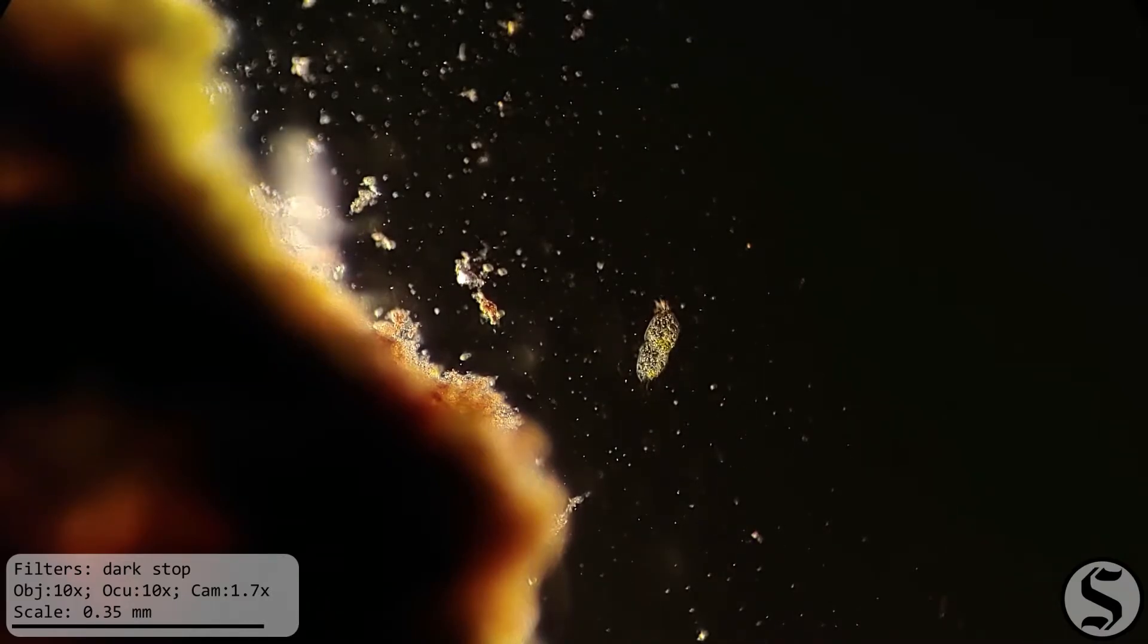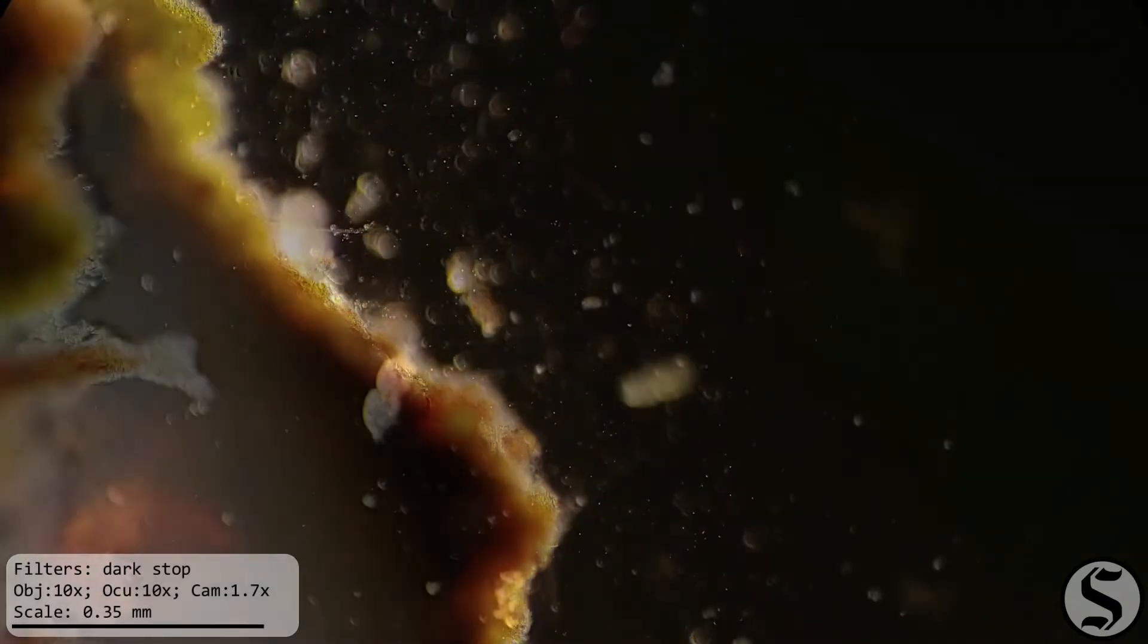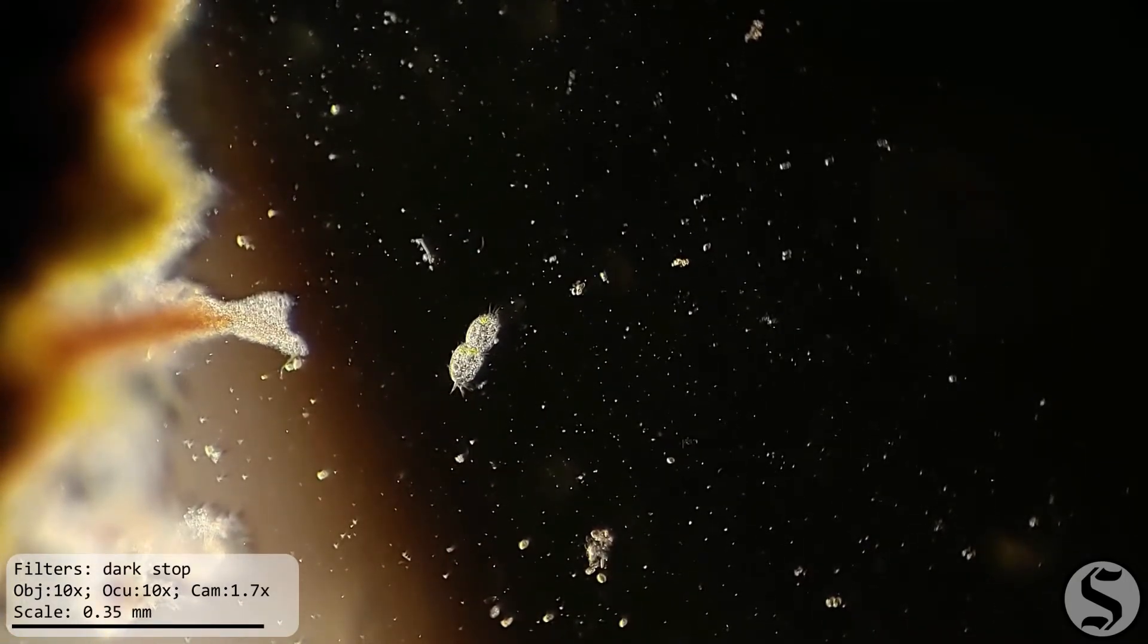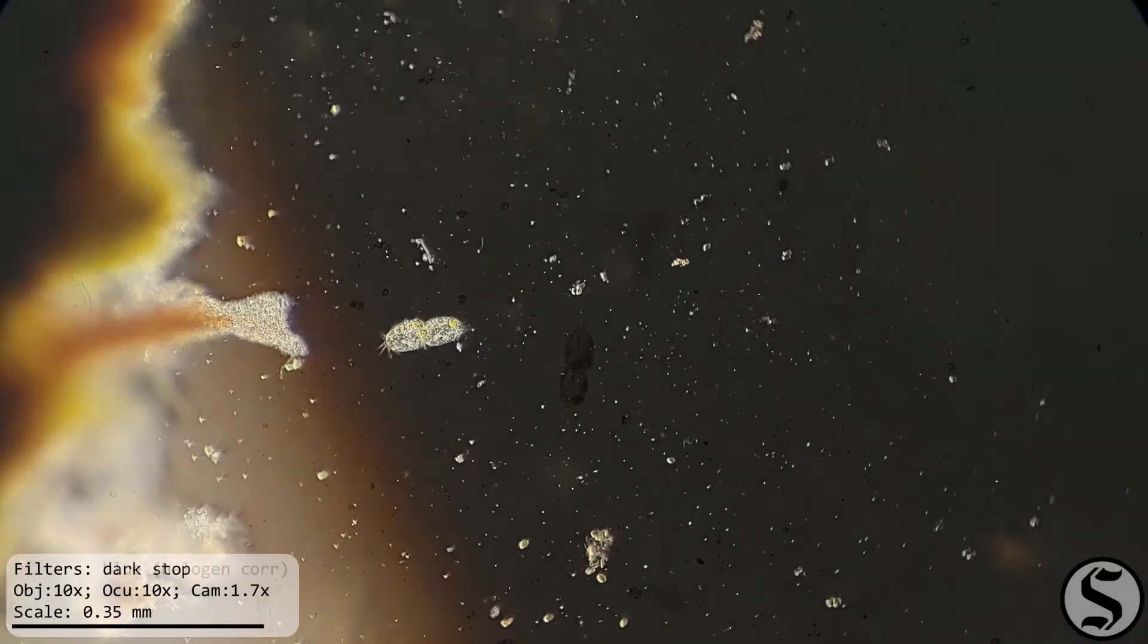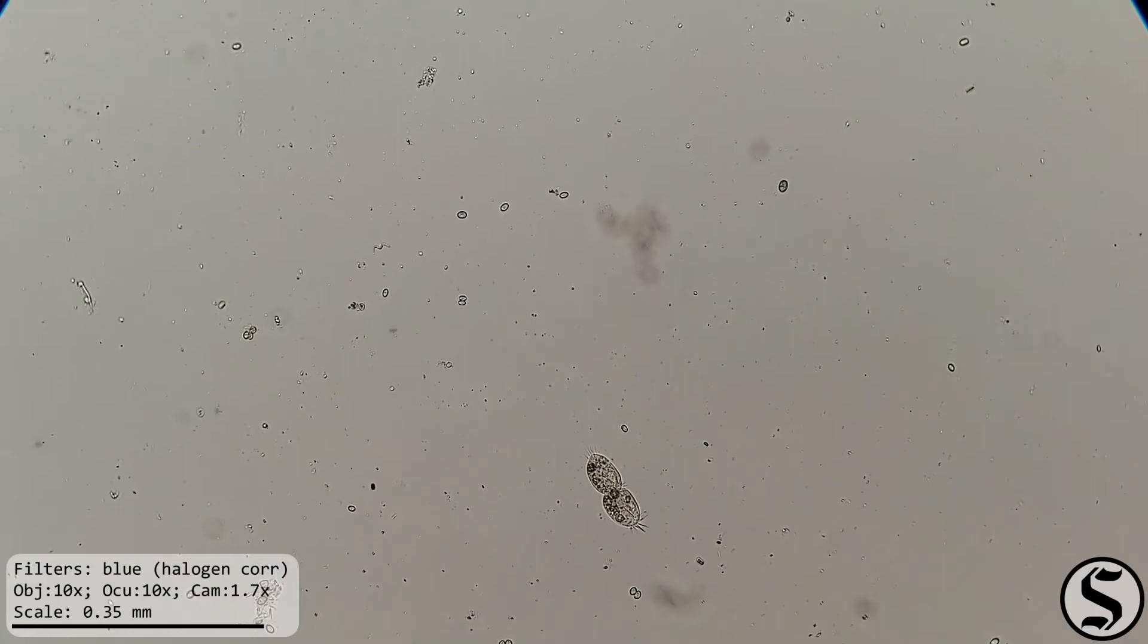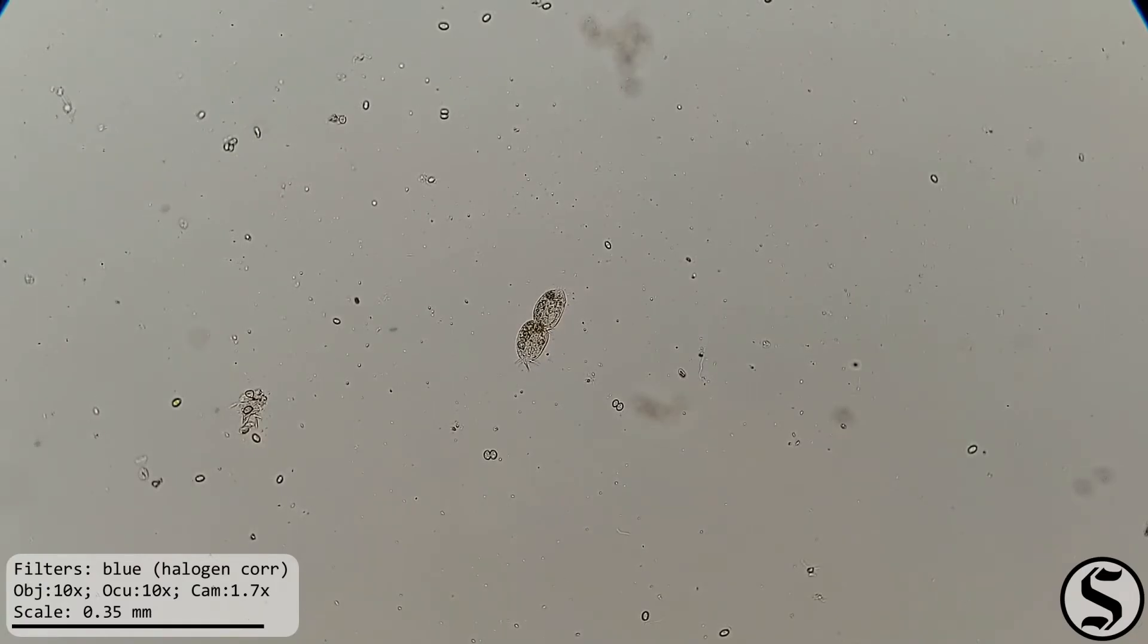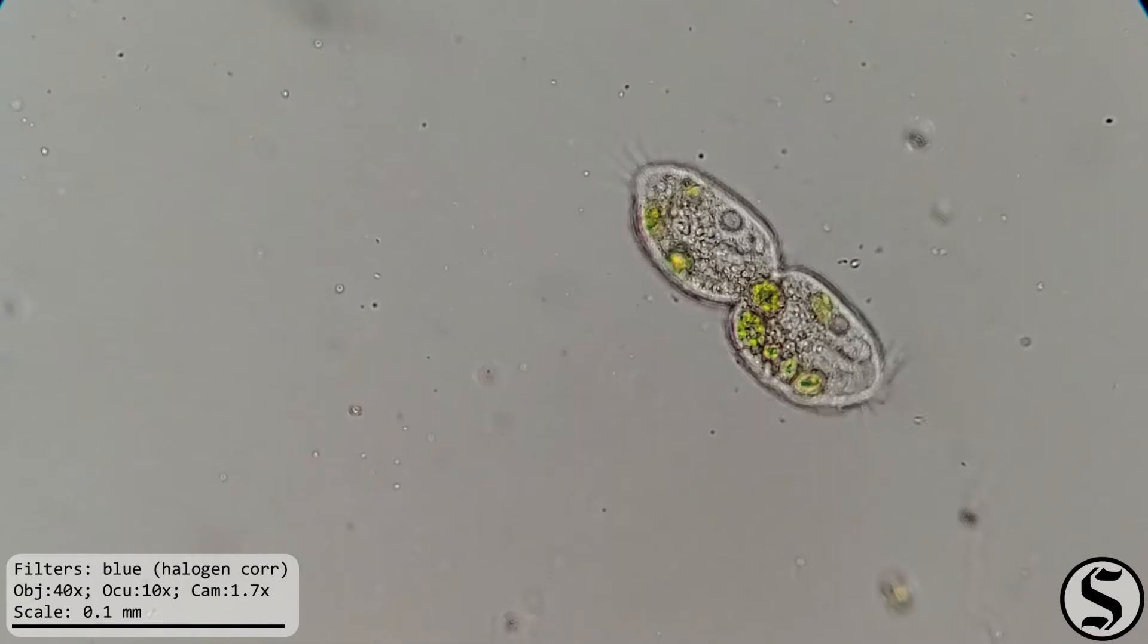So it was while I was in dark field that the real star of this show really snuck in. I noticed a hypotrix that had a little bit of a pinch in the middle of it, and it got me wondering if maybe it was going to consider dividing. So I switched to bright field again because the dark field you really have to set it up for each magnification, and bright field would allow me to switch between the magnifications a lot easier.